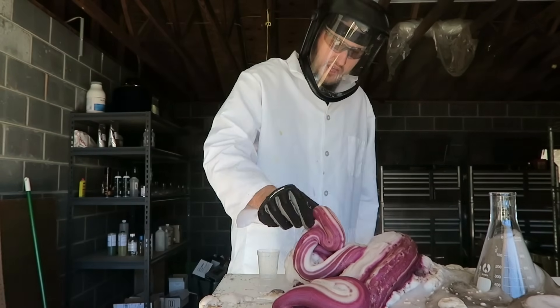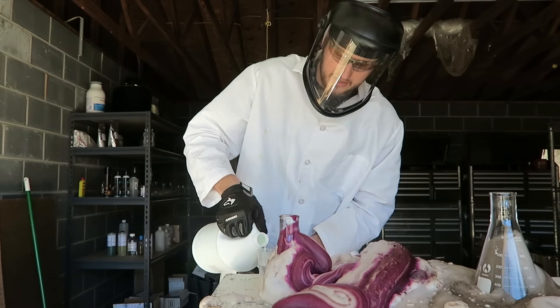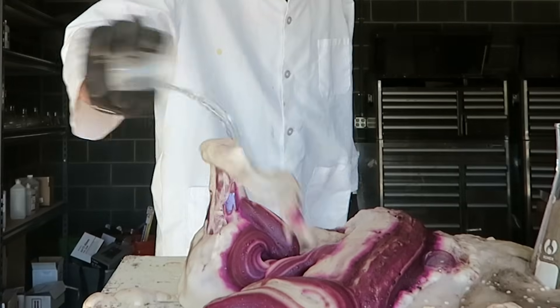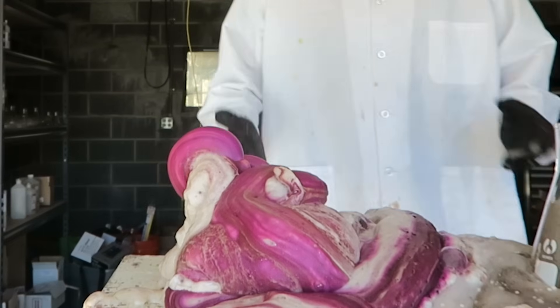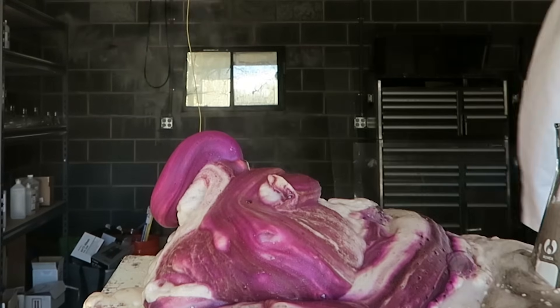That's so cool. I think we can try this again. Let's try to put a little bit more hydrogen peroxide in there. Look at the color of that foam, this is so cool! This is awesome. Well here you go, there's another way to make elephant toothpaste, and it's colorful. That looks awesome.